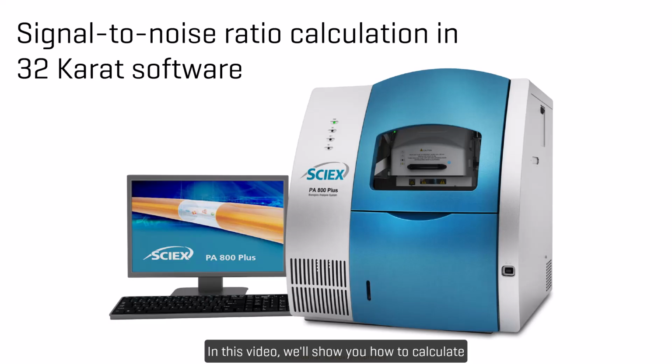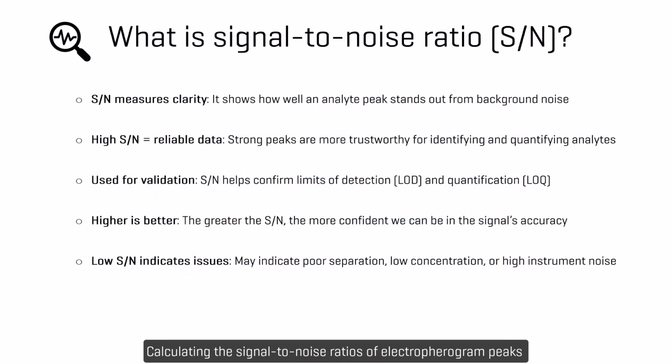In this video, we'll show you how to calculate the signal-to-noise ratio of peaks in the 32-Karat software. Calculating the signal-to-noise ratios of electropherogram peaks is a way of showing how clearly the measures of our analytes stand out from background noise. This ratio helps to determine whether a peak is reliable enough to be used as a real estimate of analyte identity and quantity.